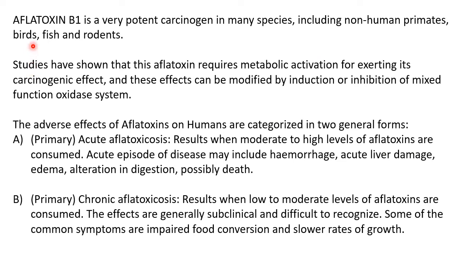Now about aflatoxin B1, which is a very potent carcinogen in many species, including non-human primates, birds, fish, and rodents. That is why we consider it very toxic, a very dangerous aflatoxin.